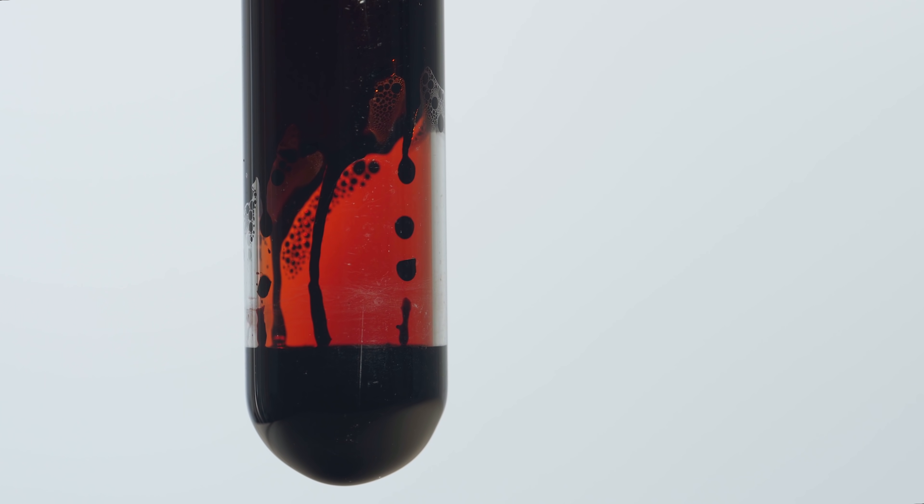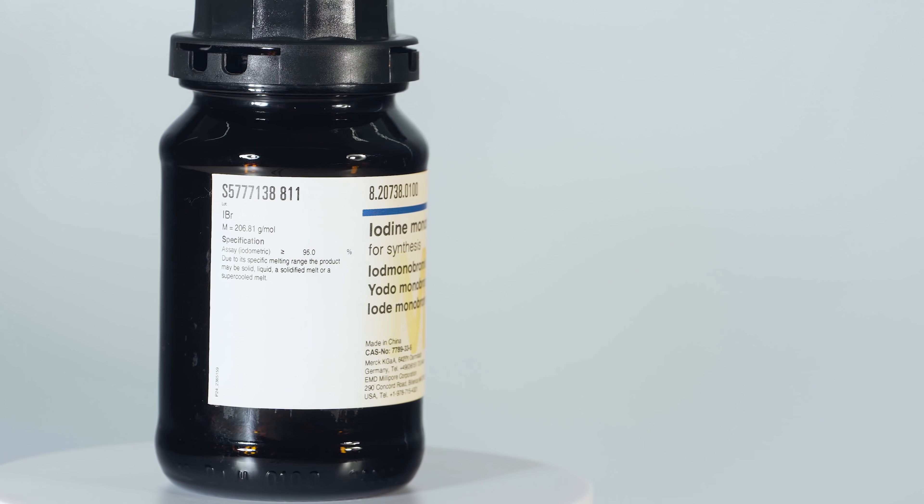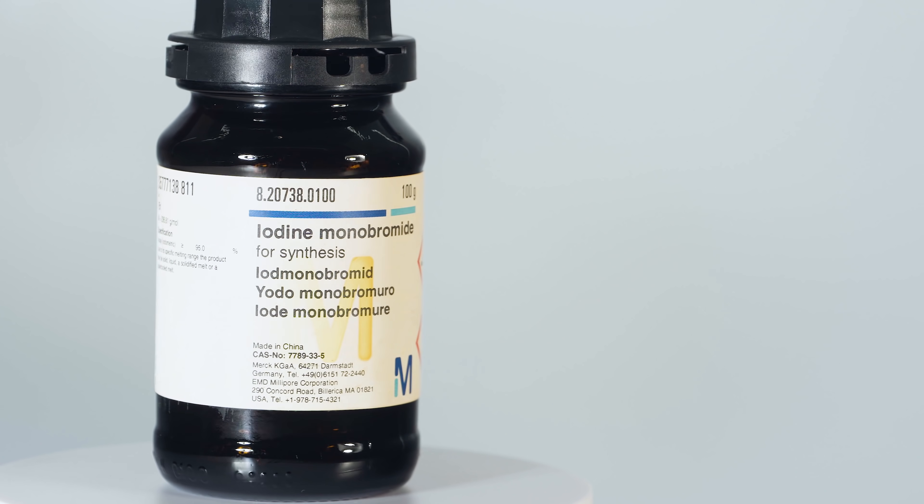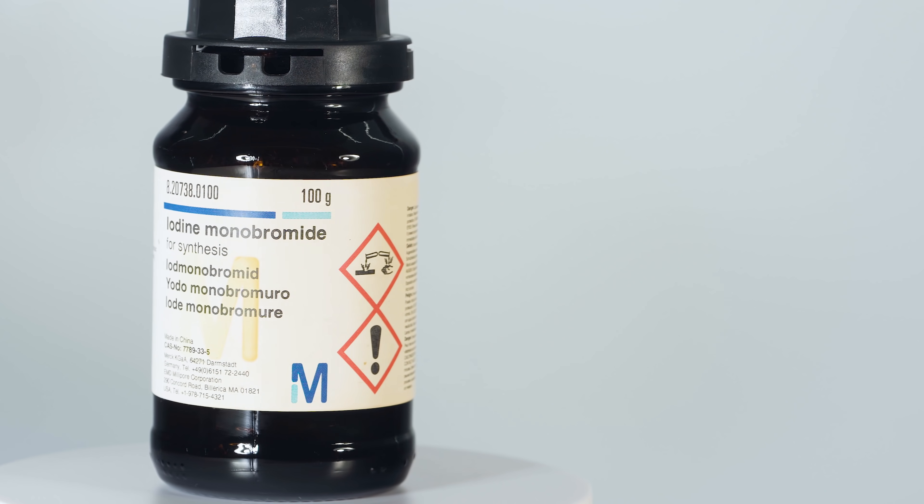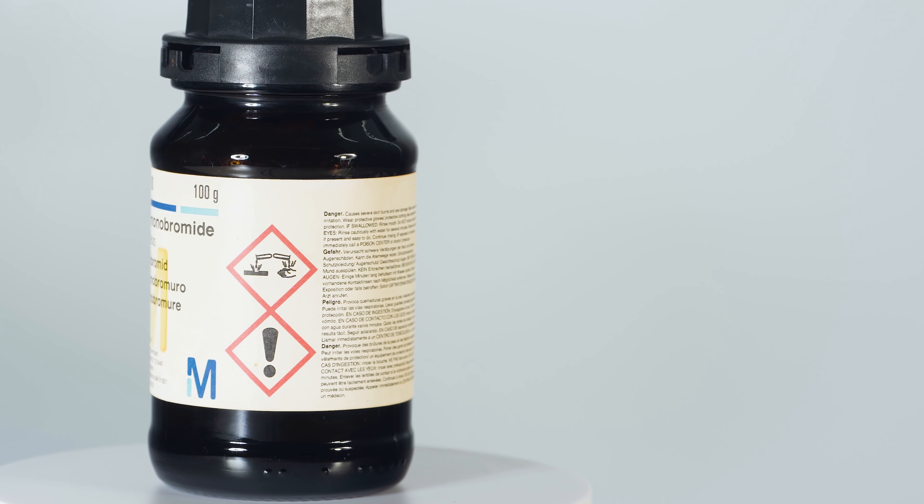It is a dark red solid. This bottle contains 100 grams of iodine monobromide. Now I'll open it and show you how the reagent looks.